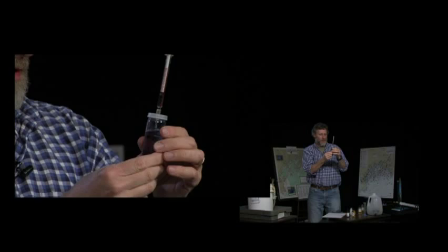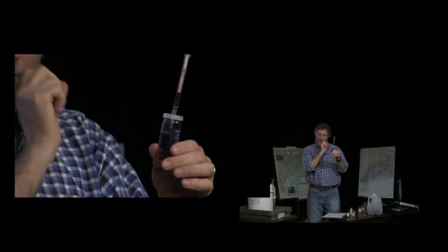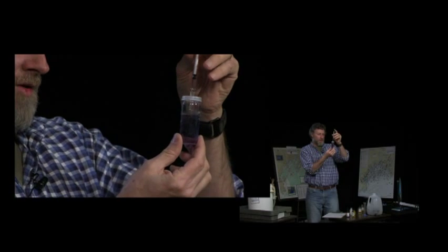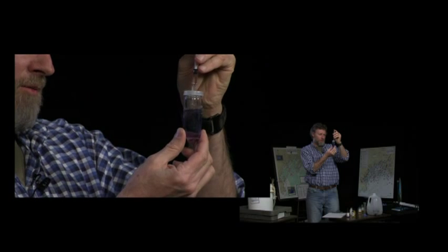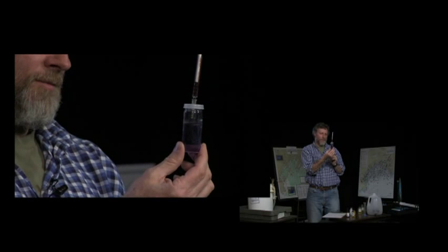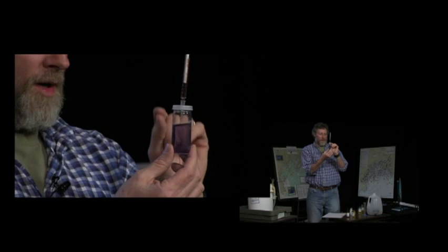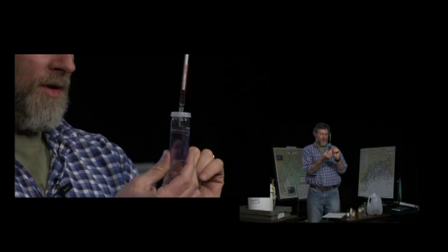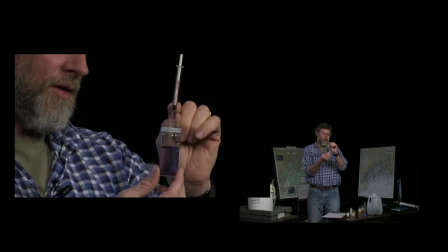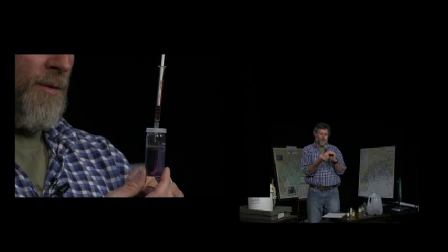What I'm going to do now is, when it gets really close, sometimes we can do what we call adding half a drop, which is by taking the syringe and kind of squeezing a little bit out onto the tip, but not squeezing it enough so that it falls in. And each droplet that drops into the sample is roughly about 0.2 milligrams per liter. And on the scale here, each little line represents 0.2.